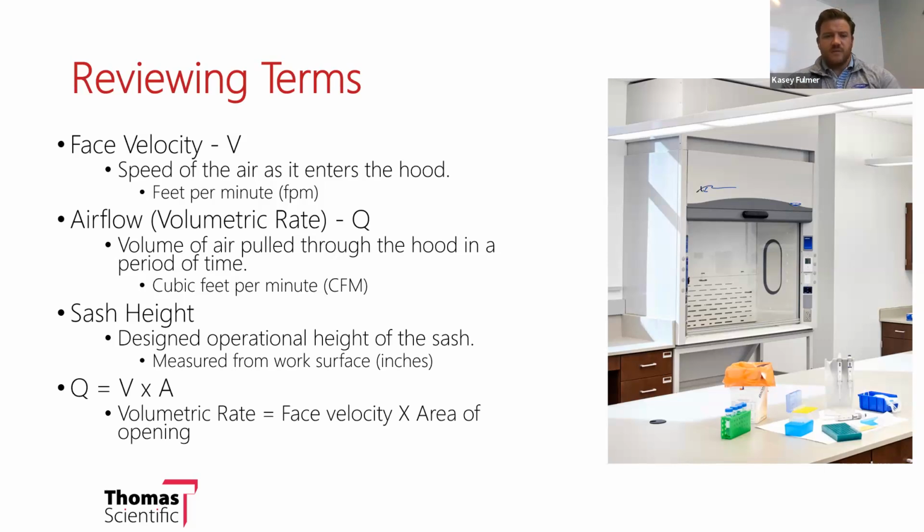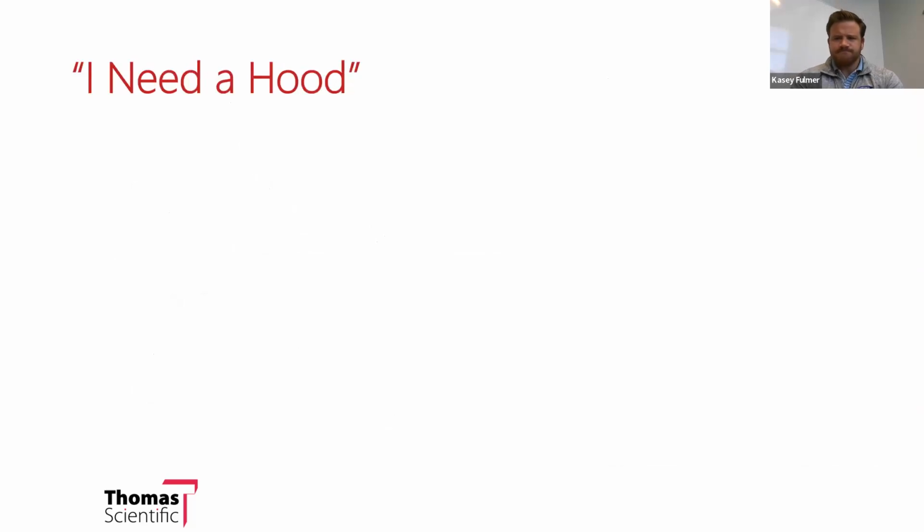So now that we have all of that reviewed, I want to get to a point for a request or a comment that I get often, and that is, I need a hood. And this is kind of a problematic generality, because a hood can mean many different things depending on what you're doing.